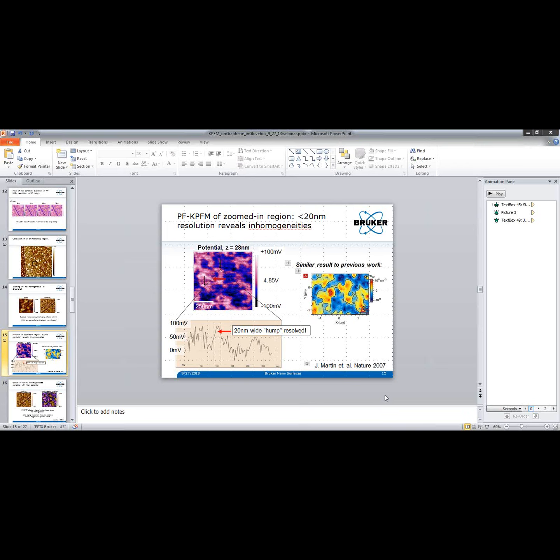And then maybe this is for Aravind. Is there a cap that can be put over the graphene to protect it from this contamination, but would also allow these work function measurements? You can consider putting a very, very thin layer of boron nitride or something. People have made sandwiches of graphene between 2 sheets of boron nitride. Very often you can eliminate the contamination by annealing as well, which we have done too, so there are ways to eliminate or minimize the contamination.